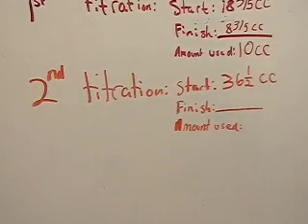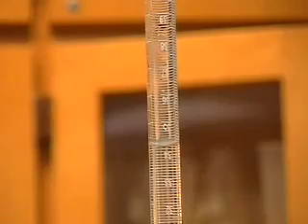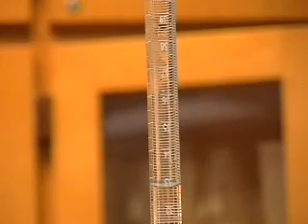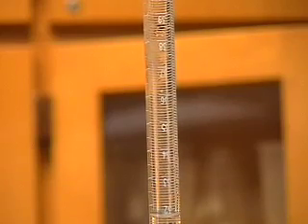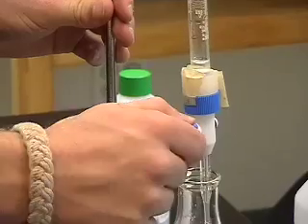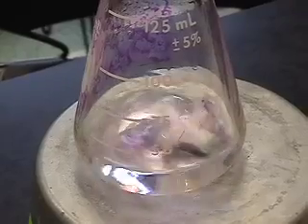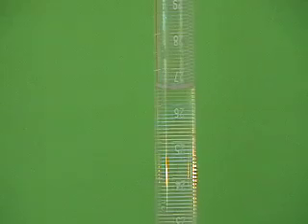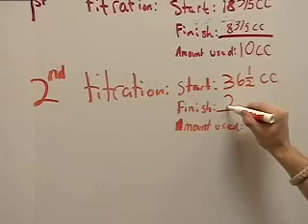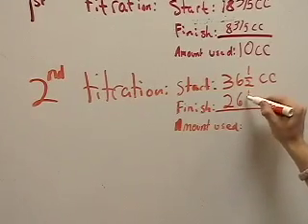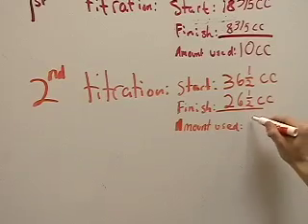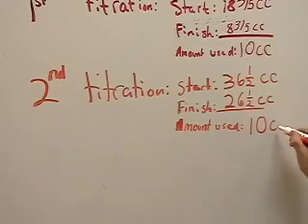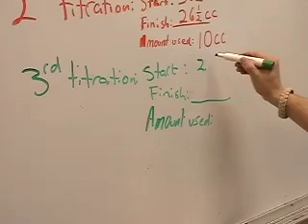This will be our starting point for the next titration. We go through the procedure again, making sure the acid in the burette flows into the flask. Once we are done with the reaction, we have a clear solution, and we see our results: 26 and a half cubic centimeters of acid left in the burette. Again, ten cc's of acid were used.